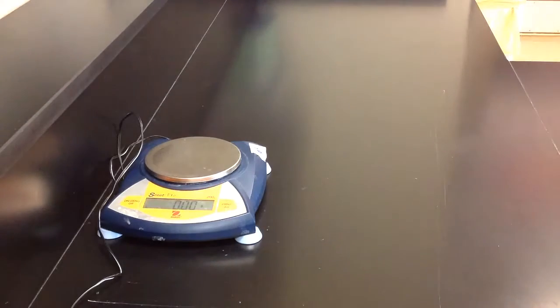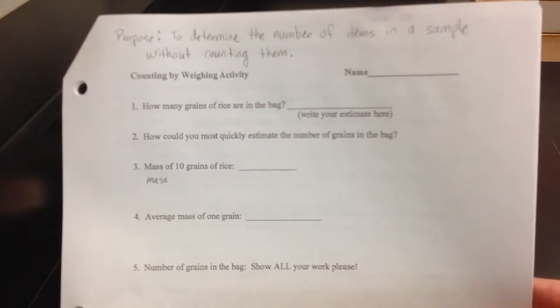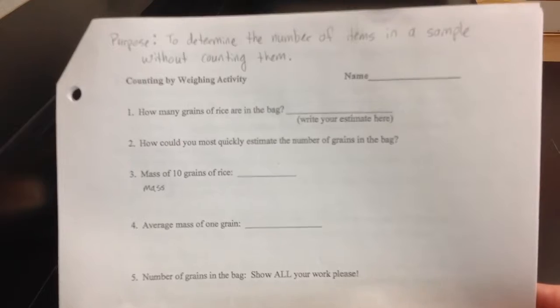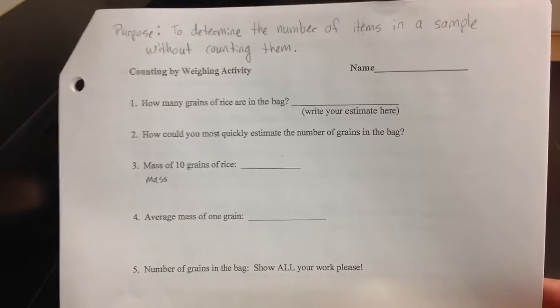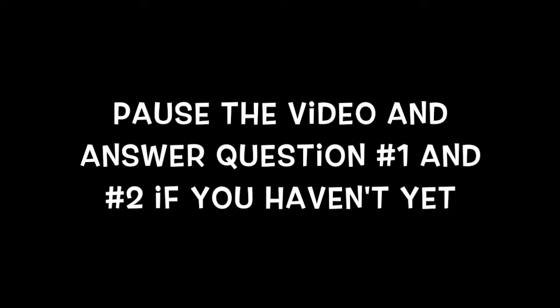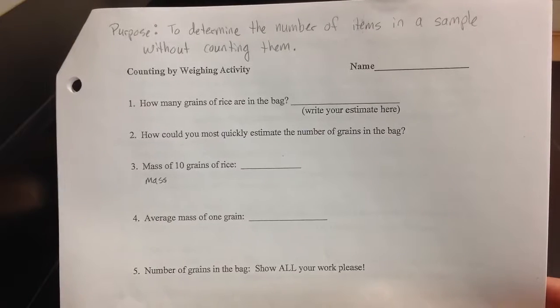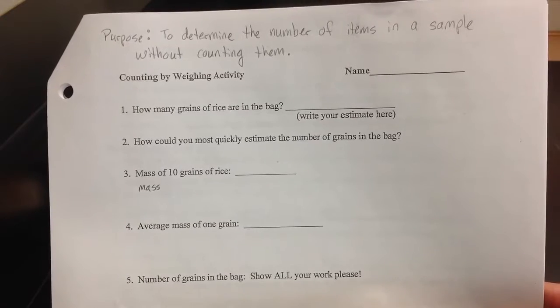So this is following along on your page. Again, the purpose of our lab is to determine the number of items in a sample without counting them. I want to know how many grains of rice are in that bag without counting them. Go ahead and answer number 1 and 2.